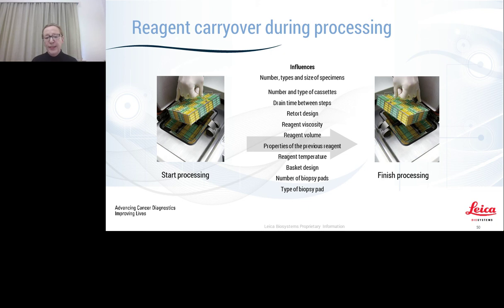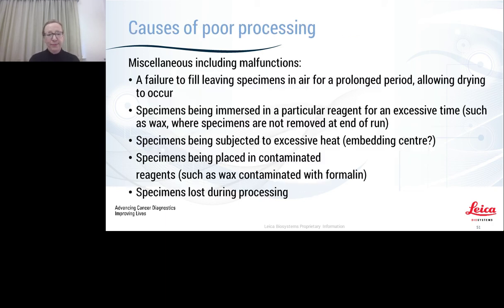So biopsy pads, while very efficient at holding small tissues in place, actually do carry over at least 10 times the amount of reagent as a standard cassette. So remember, if there's a lot of biopsy pads, that your reagents will be becoming more contaminated than you perhaps are expecting.